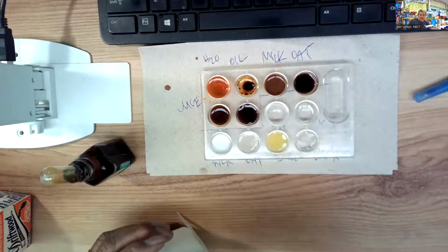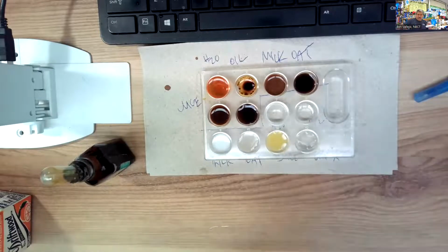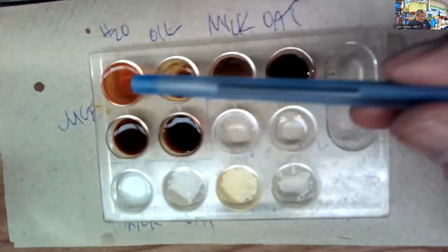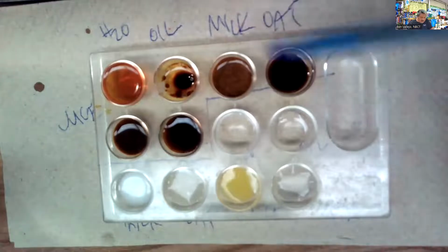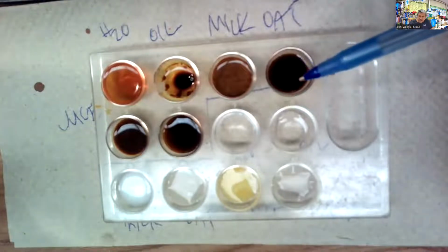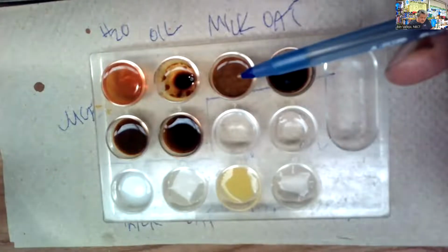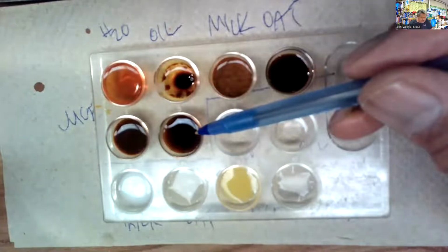How about that? All right, so it looks like, let's get a little bit closer so you can see, water and oil don't look like they have changed to the dark brown-black color. Look at that, the bottom of the oil though, it seems like a chunk. That's not it there. This one over here, the oatmeal definitely has starch in it. Milk? No, I don't think so. But the unknown X, I think does.